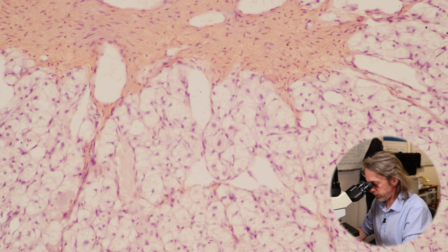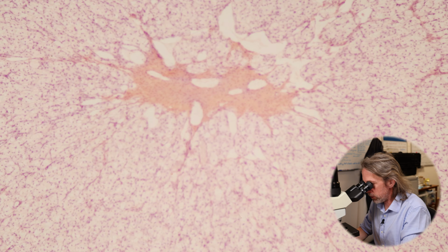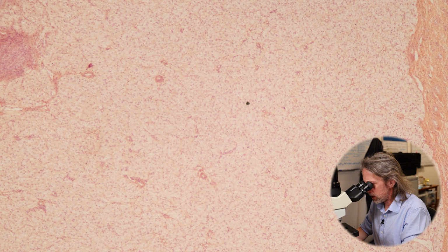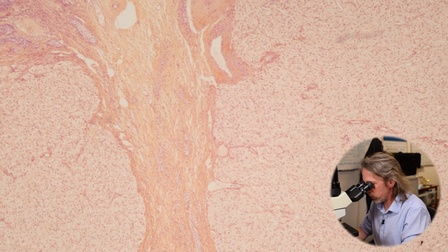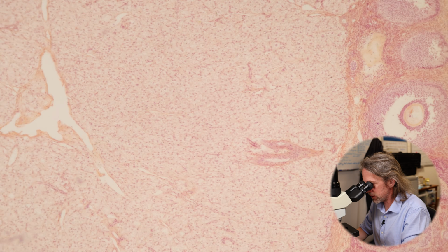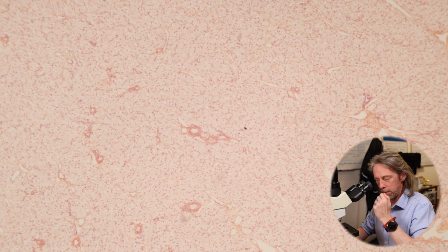So we've got multiple corpora lutea in this tissue, so I don't know what animal this has come from. But look how big it is compared to everything else.